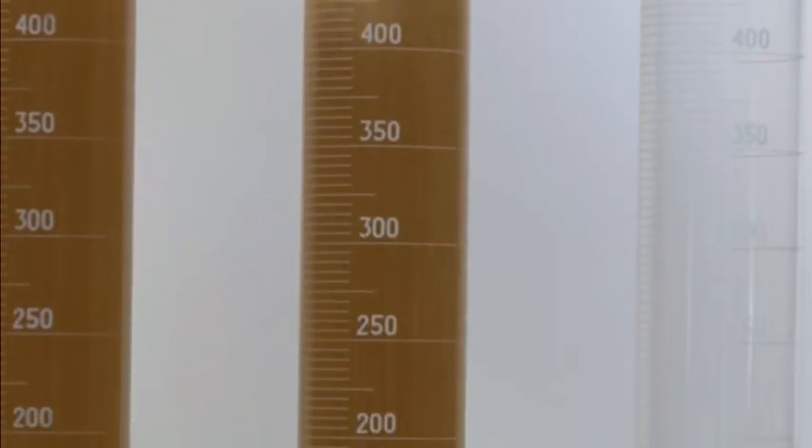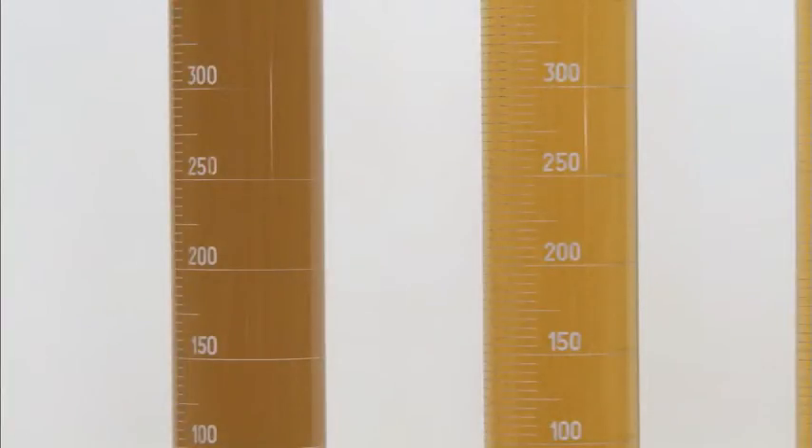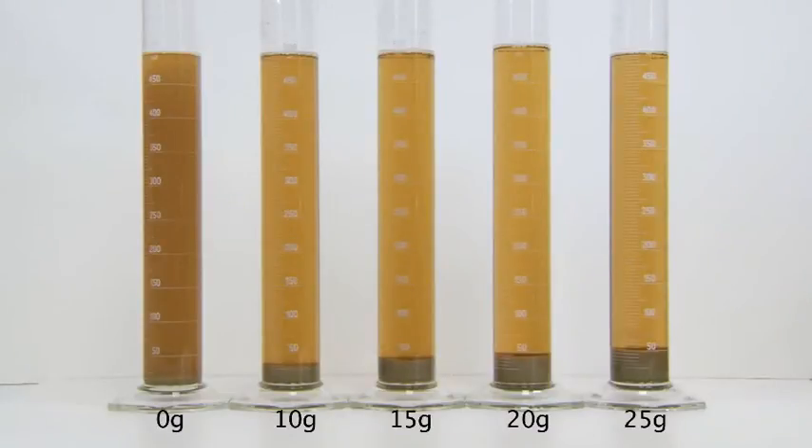This is the hot break. Next, the graduated cylinders are cooled rapidly by immersion in cold water for ten minutes. As this cooling occurs, the precipitate effect is easily observed in the samples dosed with Polyclar Brewbrite Stabilizer. The cylinders are then removed from the water bath and allowed to cool to room temperature for 12 to 18 hours. This is the cold break. After cooling to room temperature, the impact of Polyclar Brewbrite Stabilizer on particulate settlement in the wort samples can be seen.